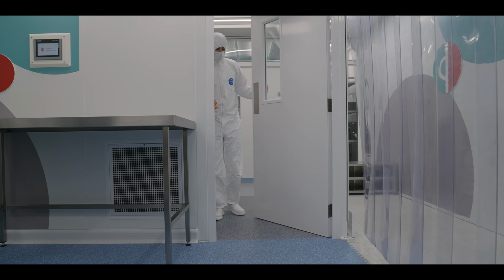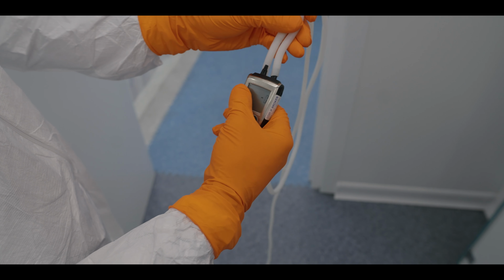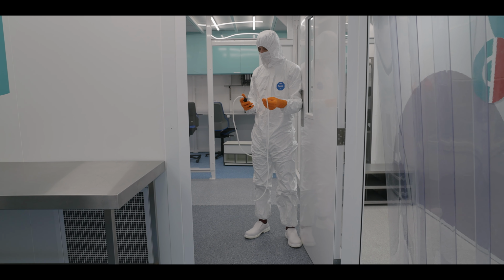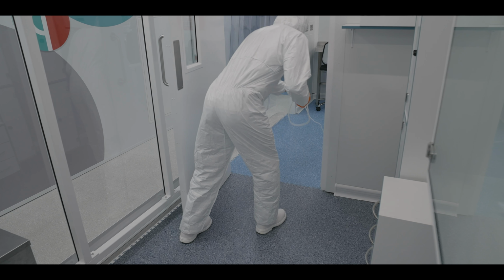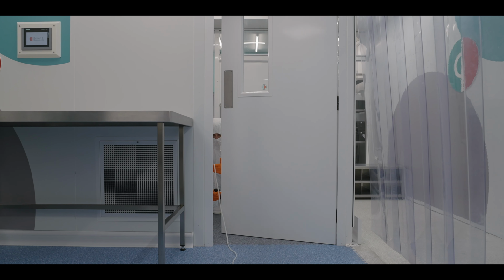In this test we're going to be looking at pressure differentials. The pressure differential test indicates the difference in pressure between two adjacent rooms, such as the main cleanroom and its change area. In order to perform this test we use a micromanometer and a length of tubing. The tubes are attached and the ports are fed under the door threshold. The display will indicate the differential pressure reading in pascals.